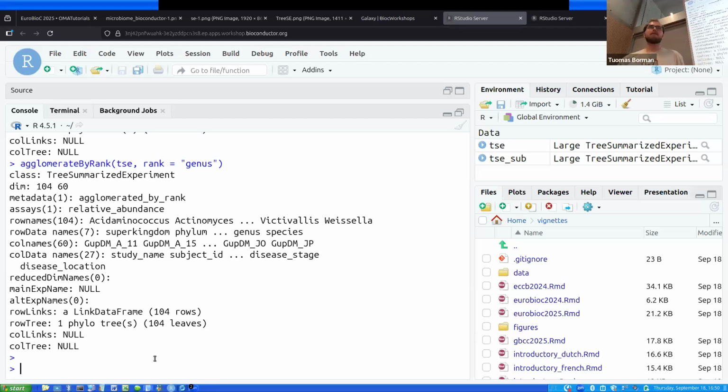Great. All these agglomeration functions, is this the one that has the option on rank only, that would then erase the missings or keep account of the missings and also enumerate them? Yes, there is this functionality, the on rank only option. I cannot remember by heart now, but it's in the documentation.